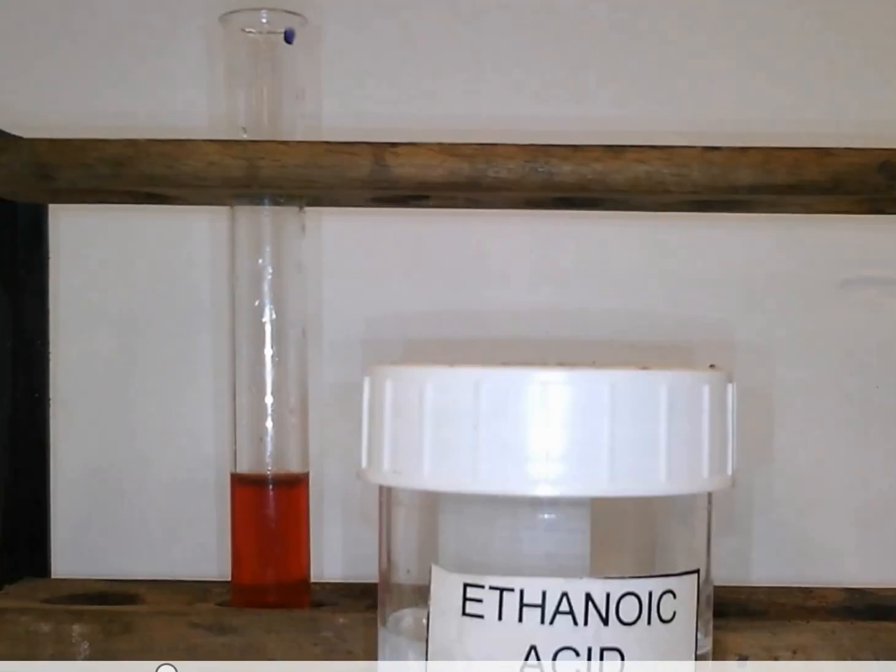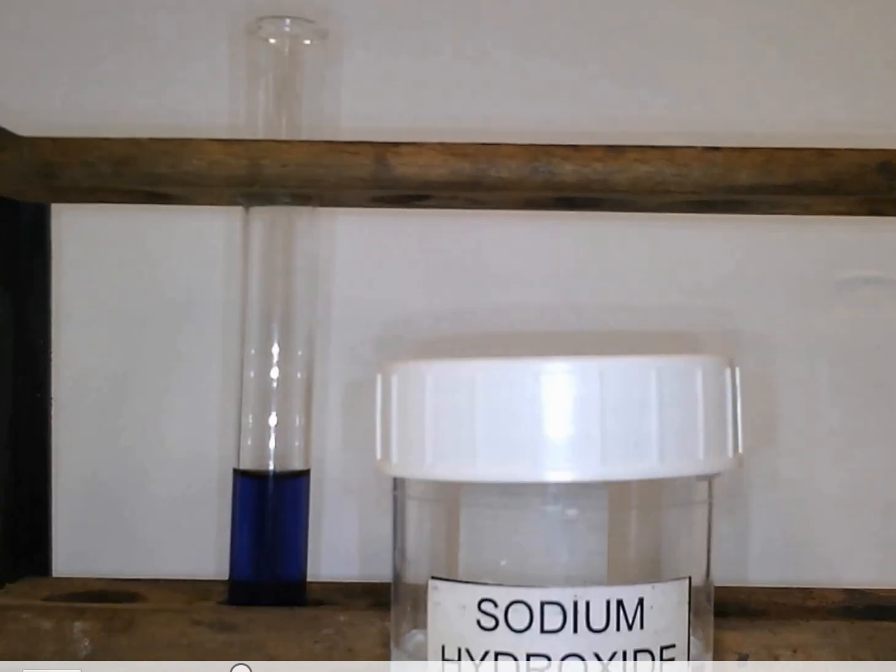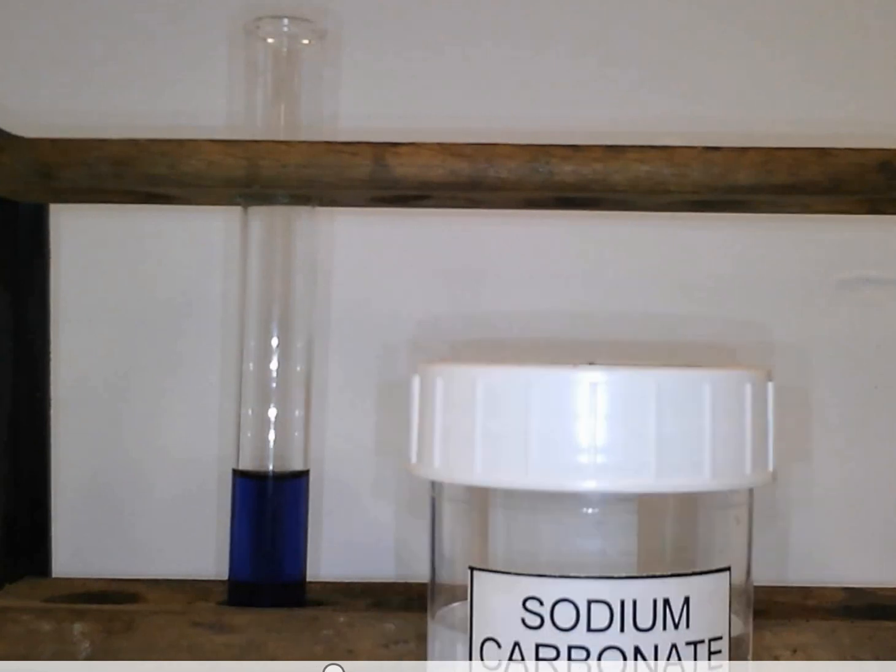Next up, ethanoic acid. So I'm going to add this to the correct column in your table, sorry, not the right hand side one. Sodium hydroxide. Then we've got sodium carbonate.